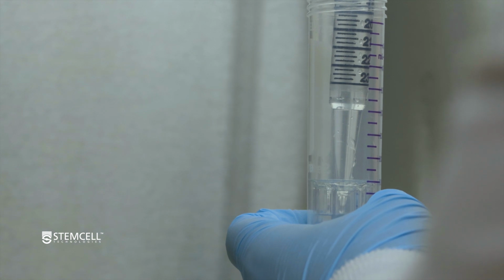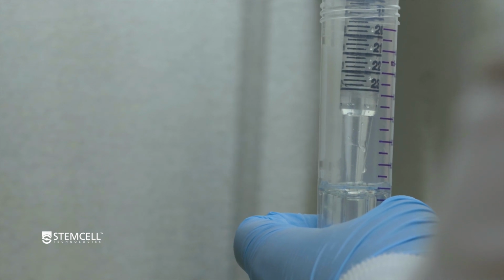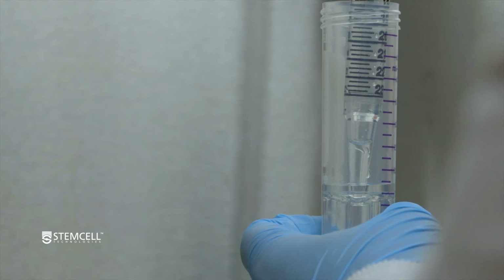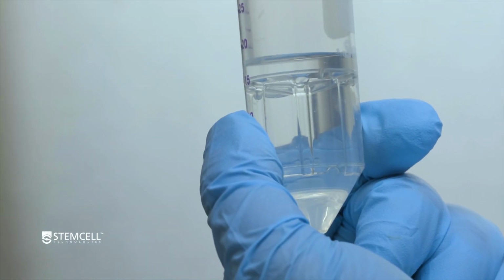A good tip is that as you are dispensing the density media underneath the insert, you'll see that you only have 1 or 2 mils left, so you can physically lift the tip up off the center hole, and that minimizes how much air bubbles will go underneath.